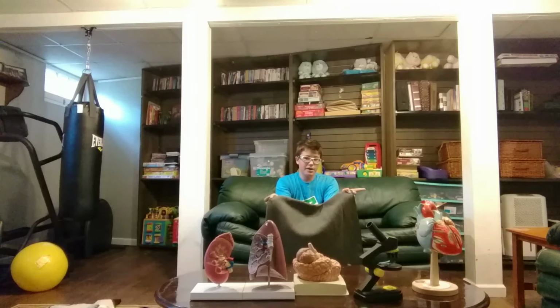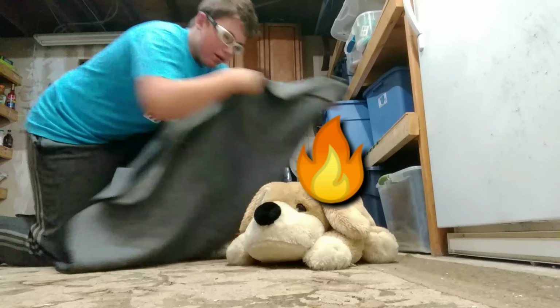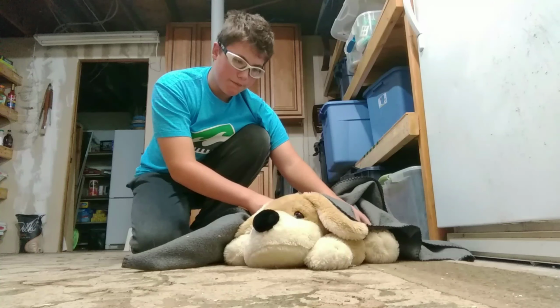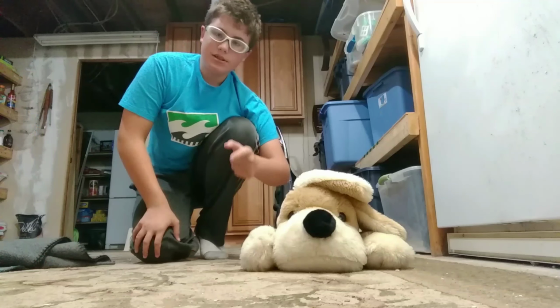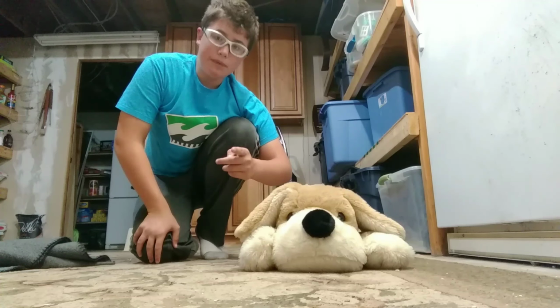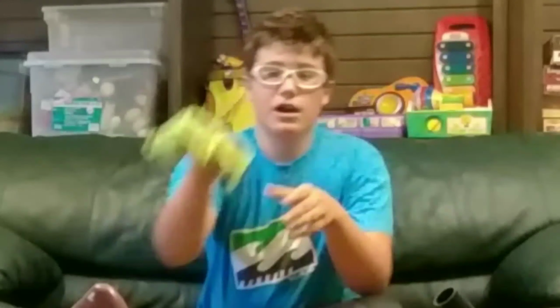So let's go help Buddy and make sure he doesn't get burned. Alright, Buddy, we're here to save you. Make sure when you're using the fire blanket to put out all the flames before letting him roam free. And once they're all done, make sure he stops, drops, and rolls. And once he's done, if he has any burn wounds, make sure to get him to the hospital and get him treated immediately.